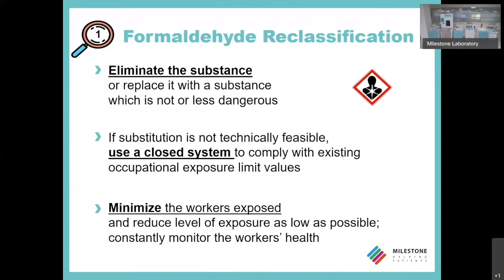Yes, there have been different fixatives on the market for years, alternatives to formaldehyde, to formalin, but none has today replaced the use of formalin that, as mentioned before, remains the state-of-the-art fixative for the biospecimen.